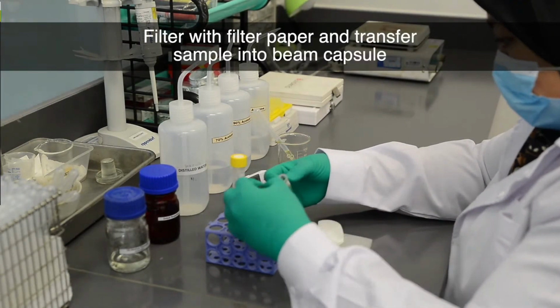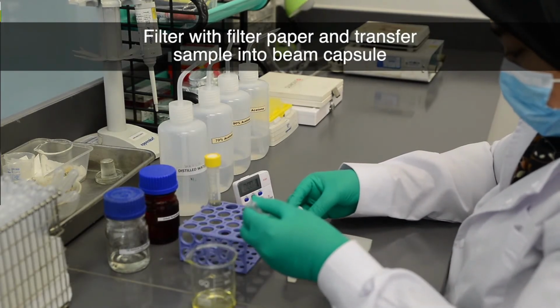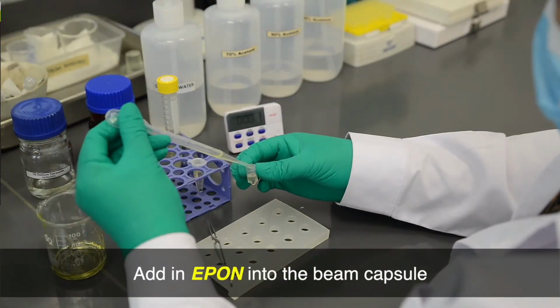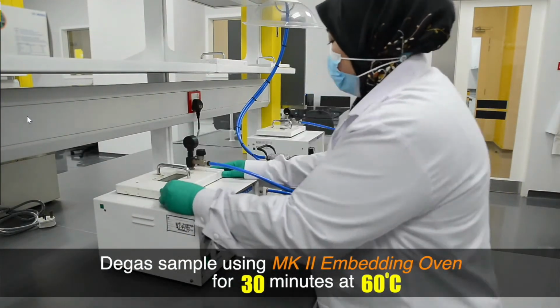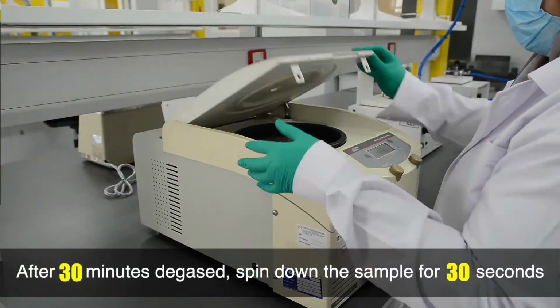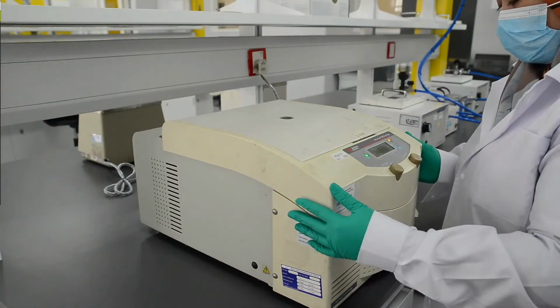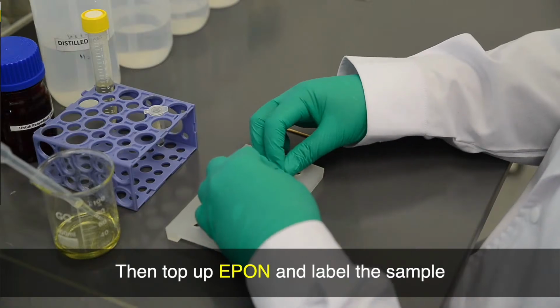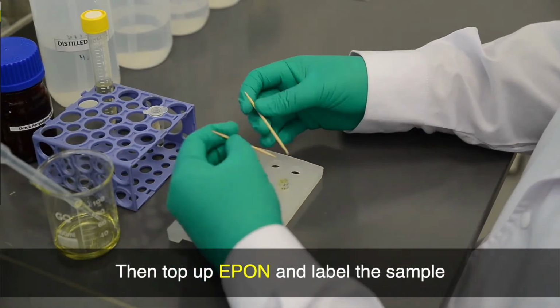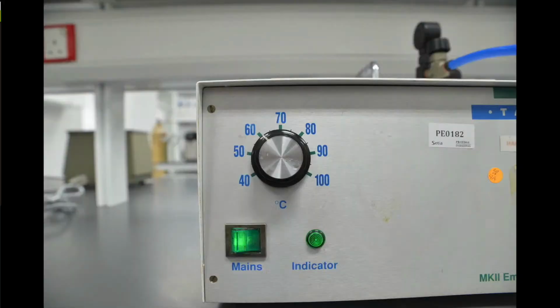And then we transfer the sample using the filter paper to the beam capsule slowly. And then we top up the EPON into the beam capsule and degas the sample in the embedding oven for half an hour, and then we spin the sample to make sure the sample stays in the middle of the beam capsule. And lastly, we top up the pure resin, label the sample, and place it in the embedding oven overnight. And this is the outcome of the sample.